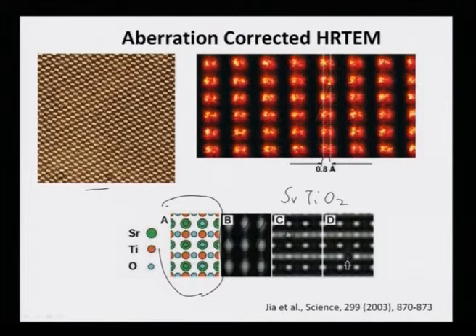Obviously, as I have shown you pictures where you can see even atoms, actually we do not see the atoms, we see the potential of an atom. When an electron interacts with the material and it forms a particular image, we see basically the potential of the atom in the imaging plane, we do not see the atoms. But many people write in the textbook and even in the lectures that, in quote and unquote, we see atoms.